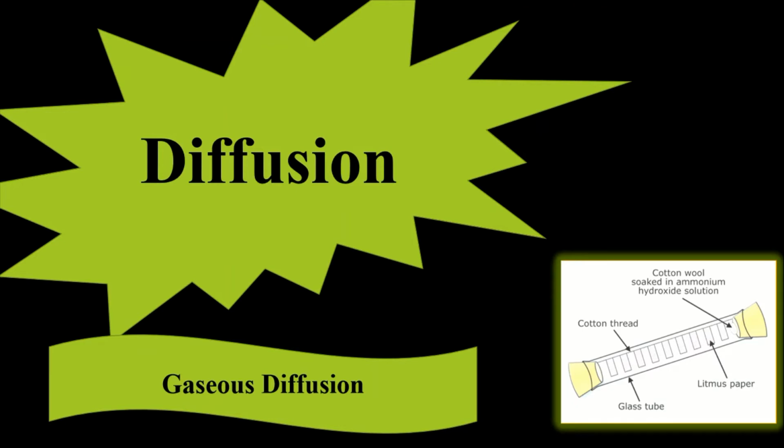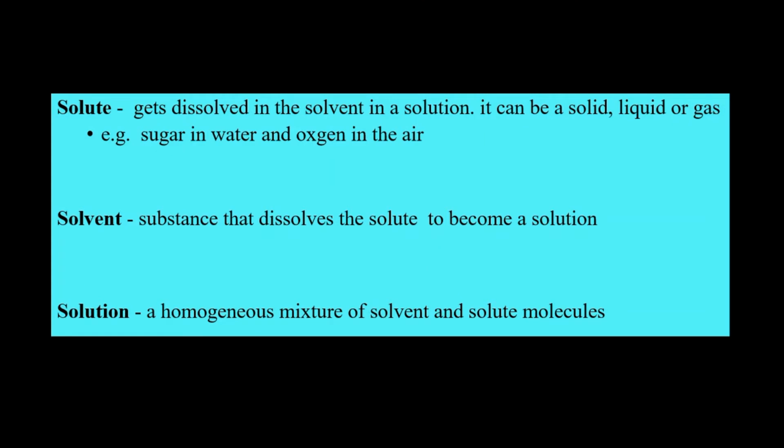All right. So for today, we are going to look at gaseous diffusion. The overall topic is diffusion, but an experiment that we are starting with is gaseous diffusion. Before we start with our experiment, let's define a few terminologies. What is a solute, what is a solvent, and a solution?